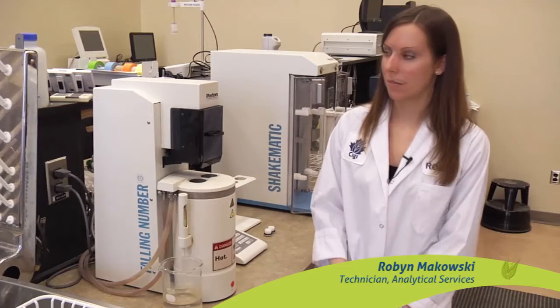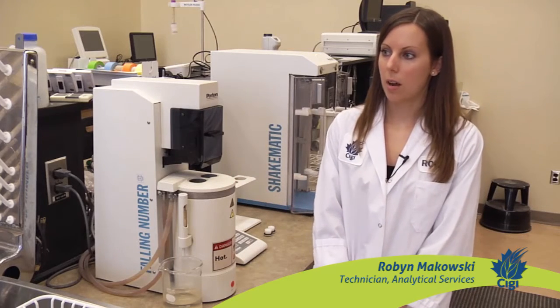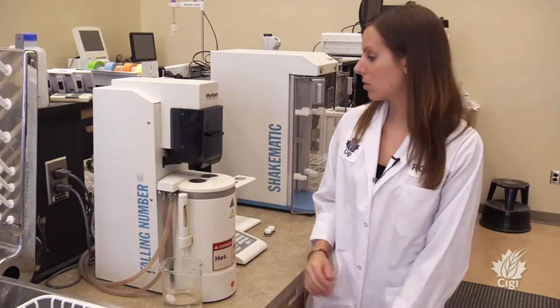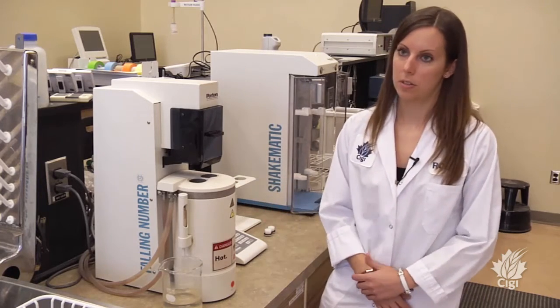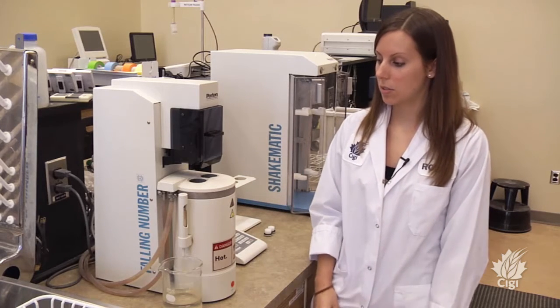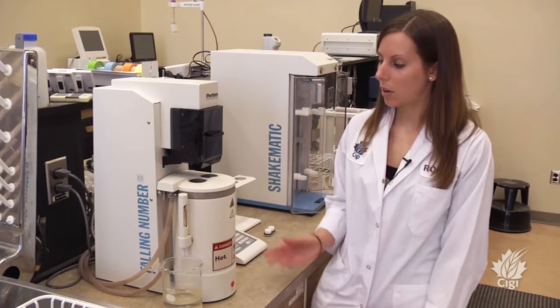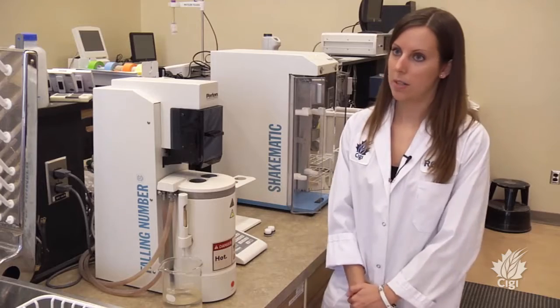This is the falling number test. It involves the grinder, the shake-o-matic, and the falling number instrument. Once we receive the whole kernel sample, we grind about 250 to 300 grams. We weigh out 7 grams and mix it with 25 milliliters of water, then it goes into the falling number instrument. The sample mixes for 60 seconds, then the stir rod is allowed to fall through the sample, and the time it takes to fall through is the falling number — measured in seconds — to measure sprout damage and alpha-amylase activity.